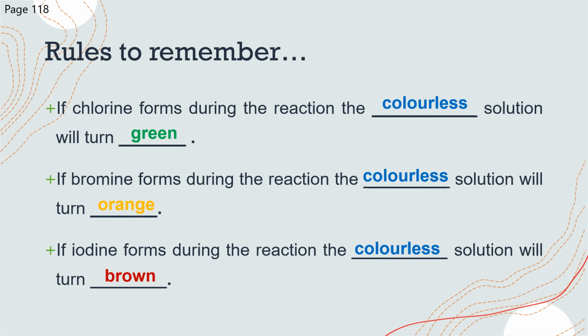And it will be the element dissolved in water. That's why it's not just identical. That's why chlorine's green here and not yellow-green. It's why bromine's orange and not red-brown. And it's why iodine is yellow-brown and not grey-black. If it was just pure iodine, remember, that is a solid. So this is iodine dissolved here. Okay, let's move on to the next page then once you get all this copied in.